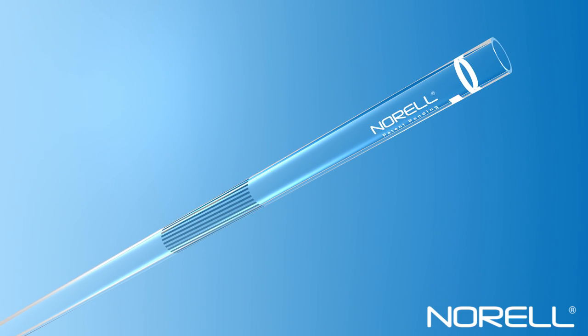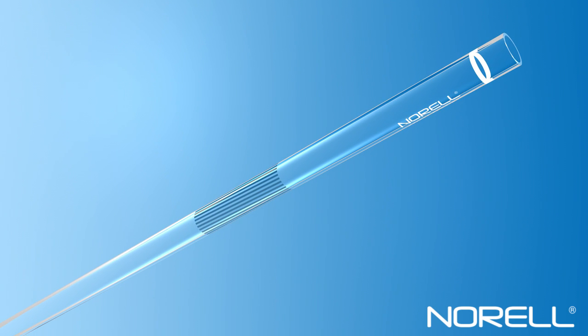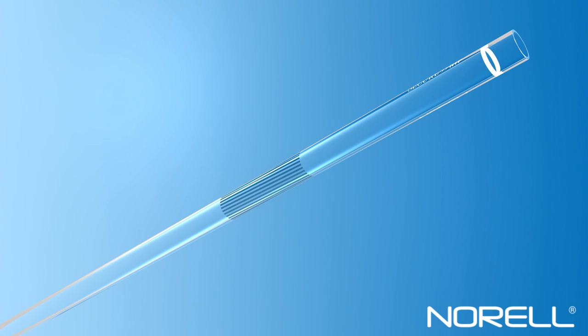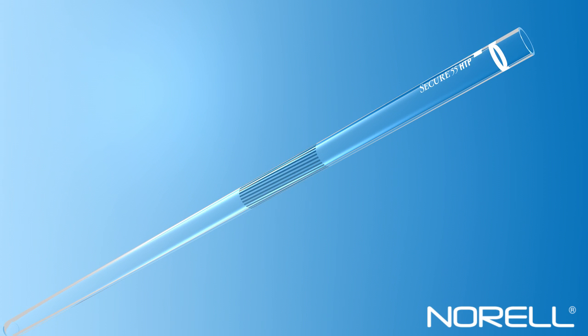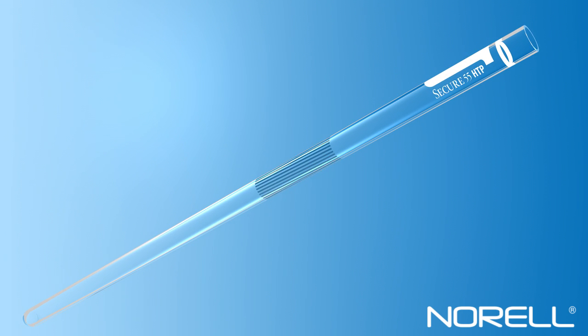The Secure 33 Series are made from ASTM Type 1 Class A borosilicate glass, or equivalent, and have like properties to the Norell Select Series NMR tubes.